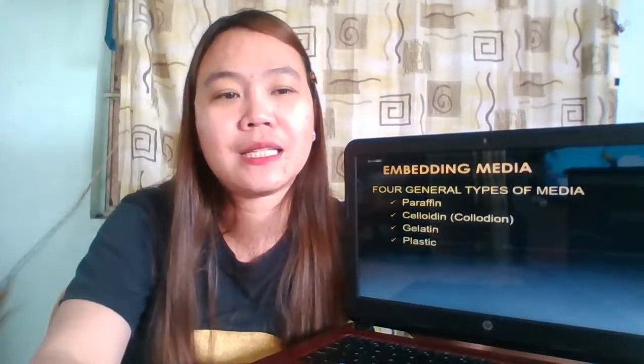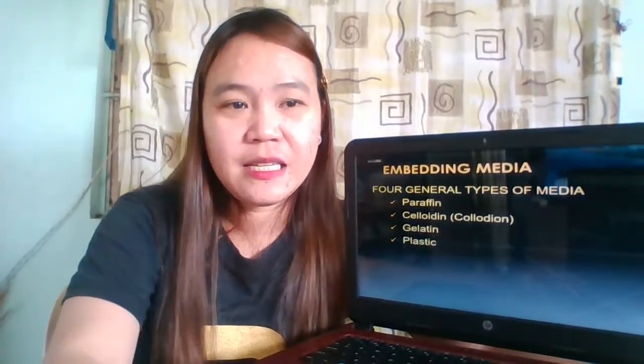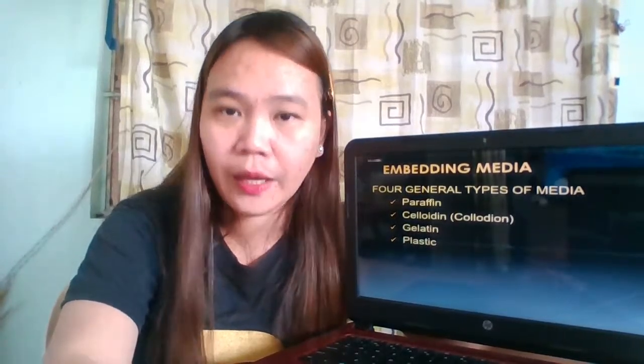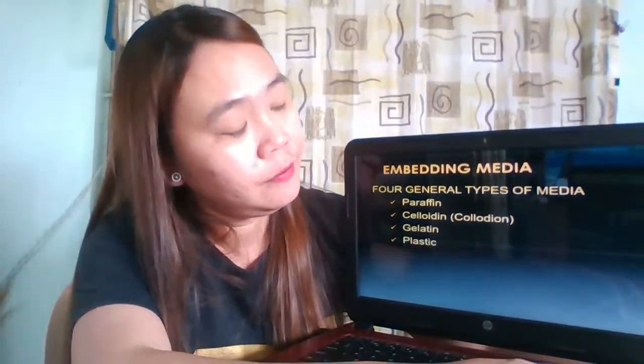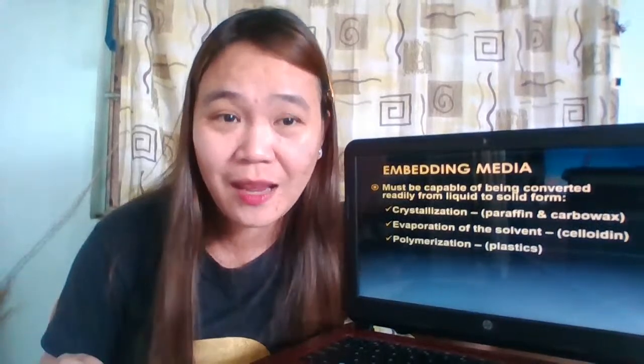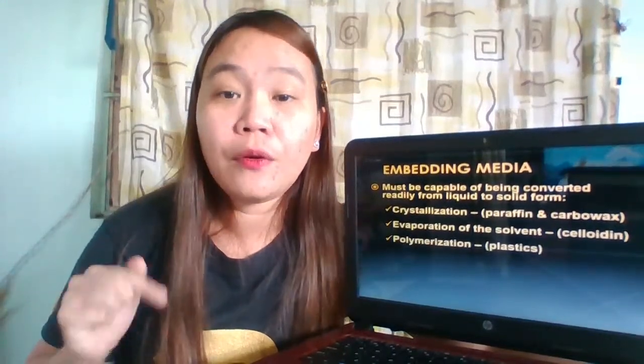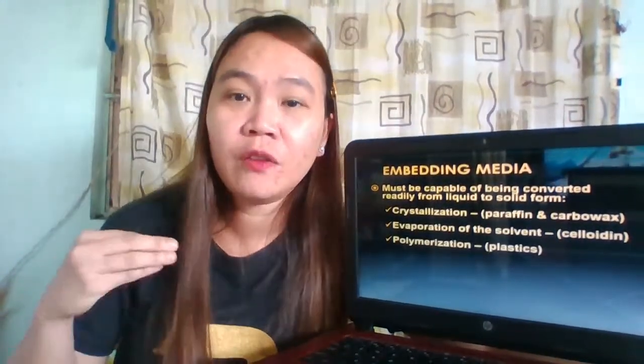Regardless of the embedding medium that we use in the laboratory, the most important characteristic of your embedding media should be that it is capable of being converted readily from liquid to solid form.